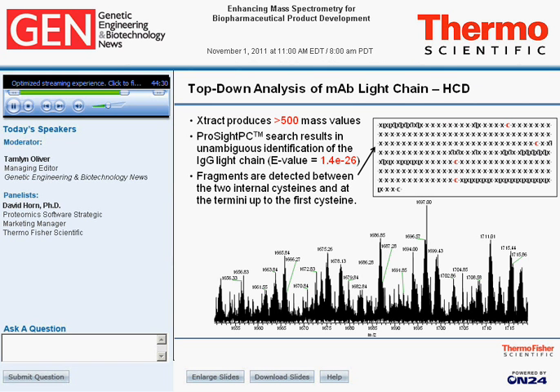So in this case, we see a large number of fragments in the middle of the sequence, but we also see fragments close to the termini, and nearly full sequence coverage on the C-terminus. And again, the fragments in the middle include this -2 Dalton disulfide modification, and so we further confirmed by an alternative MSMS technique that this is the structure of this protein. Next slide, please.